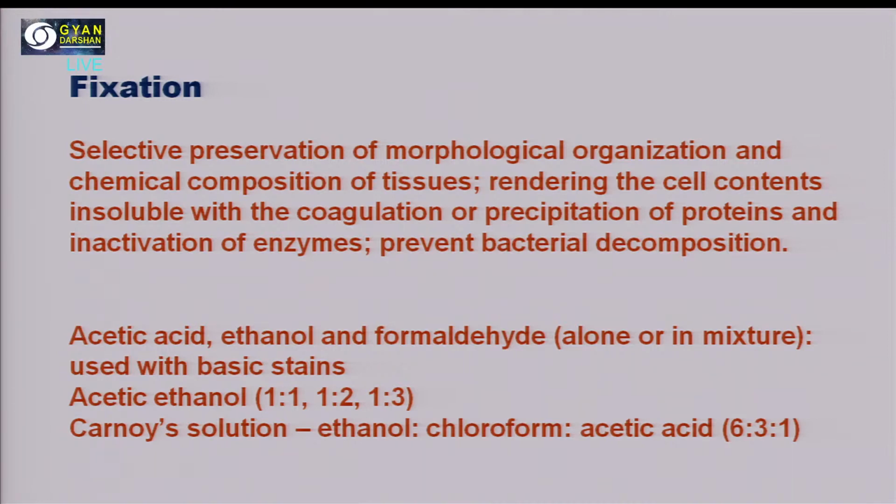What is the purpose of fixation? Selective preservation of morphological organization and chemical composition of tissues, rendering the cell contents insoluble with the coagulation or precipitation of proteins and inactivation of enzymes, and preventing bacterial decomposition. So these are the three main purposes of undergoing the fixation process.